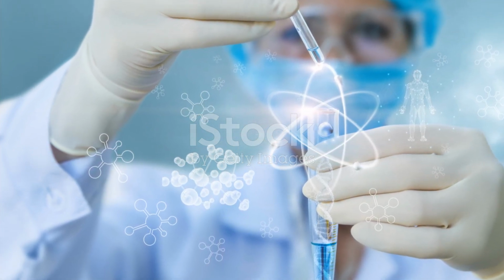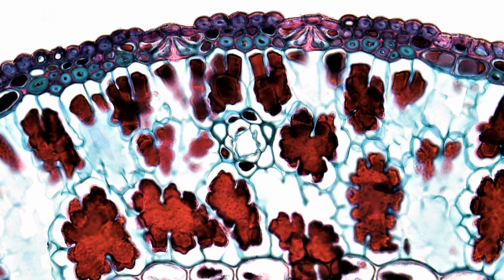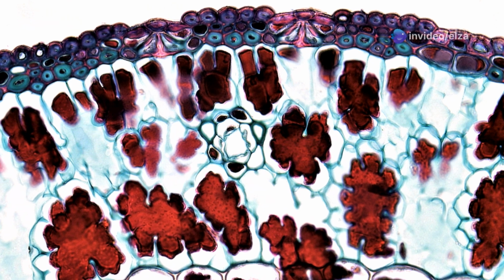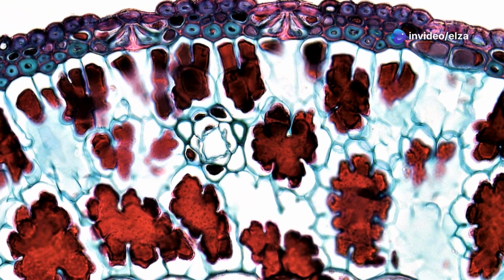Second, spatial resolution. This technique offers excellent spatial resolution, enabling researchers to pinpoint the precise location of radioactive substances within cells and tissues. Third, versatility. Autoradiography can be applied to a wide range of biological samples, including tissue sections, cell cultures, and even whole organisms.